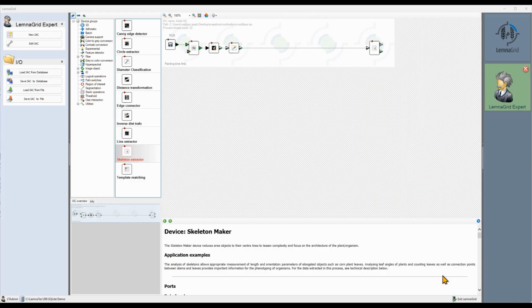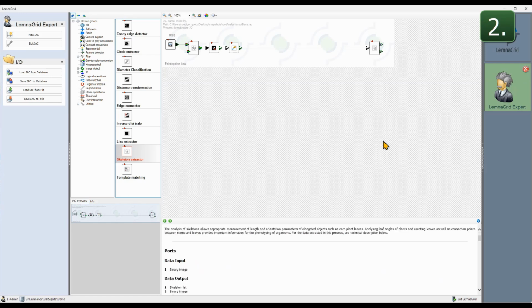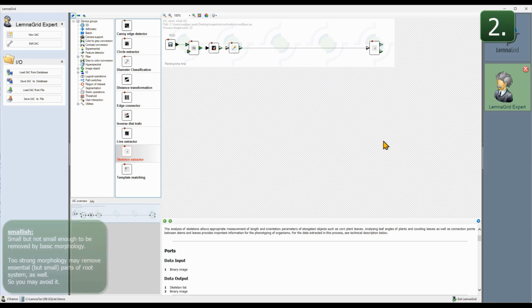Here are a few techniques to handle these. You can use all the segmentation cleaning techniques described in previous videos, such as morphological multi-stack device and the fill area device. In any case, you should start with them. If you want to remove objects which are far away from the main root, but which are smallish, but not really small, then you can do the following.